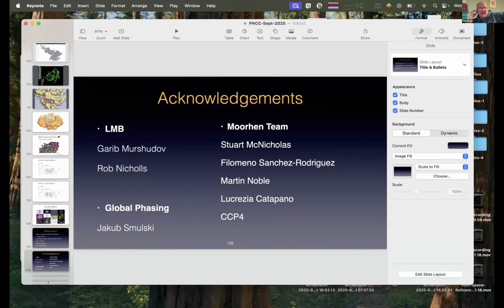That's as much as I can give you at the moment. There's a tool, and you can use it. It's old. It's based on a tool that I can't remember. It's called Wasp. I don't remember the author. Yeah, that's it. I think it's Enrico de Serra. Yes, thank you. Thank you.